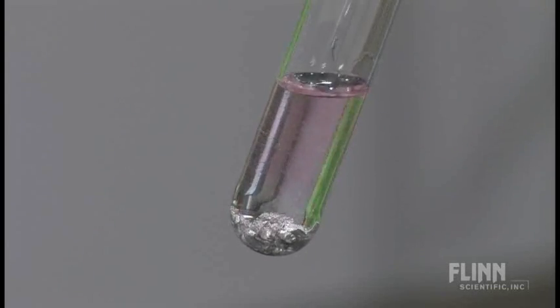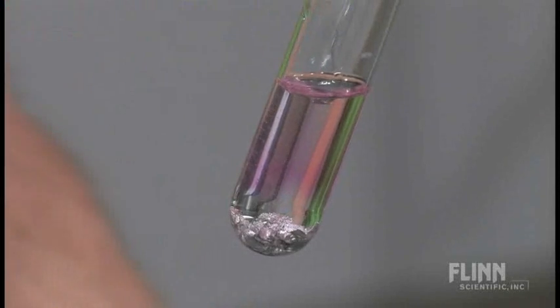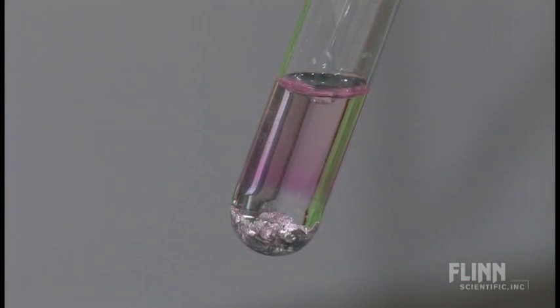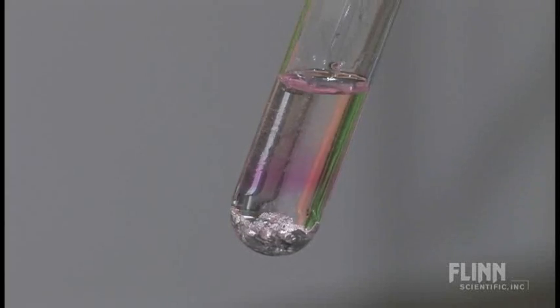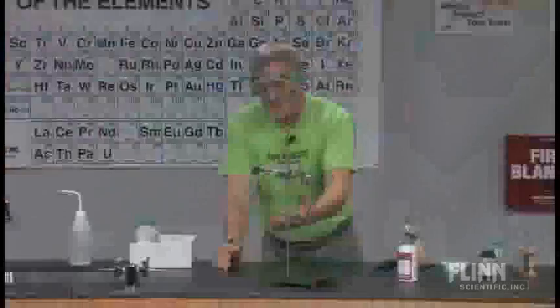Ah, there it is. Do you see that right when it falls in? See the pink? Hydroxide ions are in there. All right, so I didn't collect the hydrogen because that's a little bit difficult to do sometimes, but I can certainly see that hydroxide ion has been produced, and so the reaction is taking place.